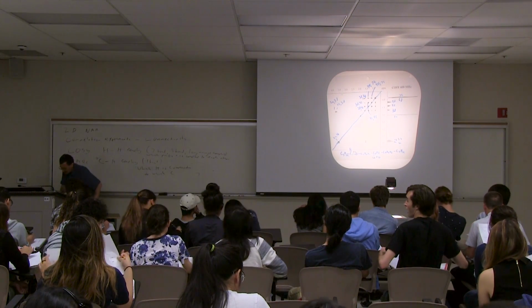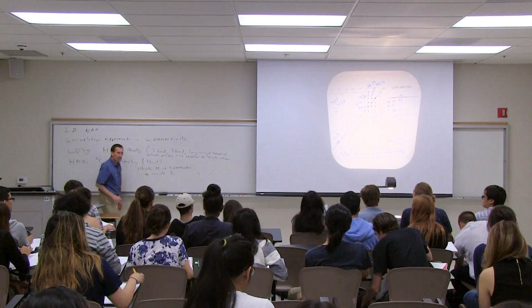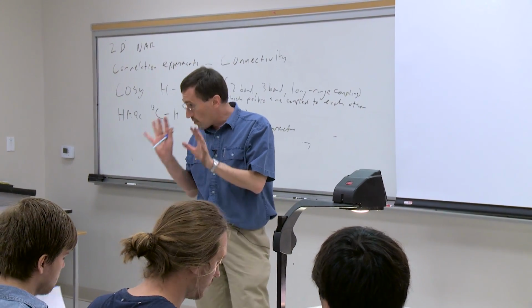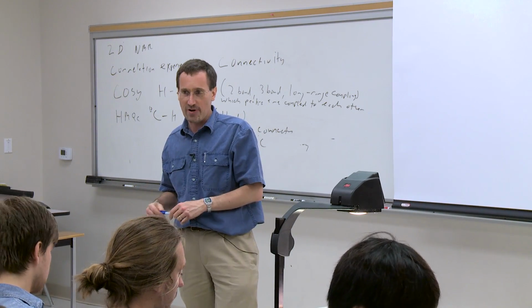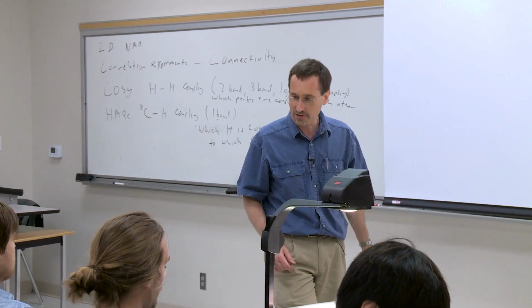And that is how I like to use 2D NMR spectroscopy plus reading IR, reading your proton, reading your carbon to solve the structures, to determine the structures of organic molecules.